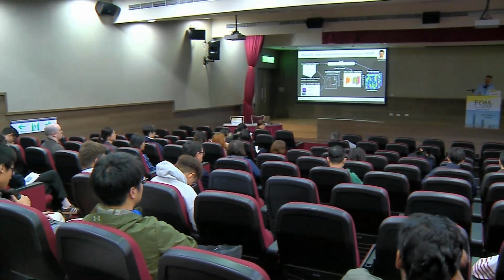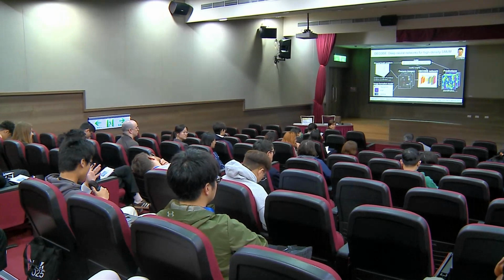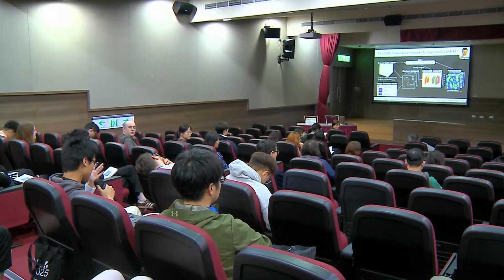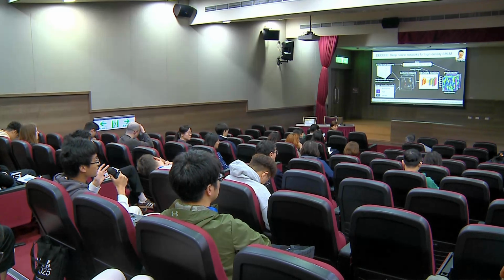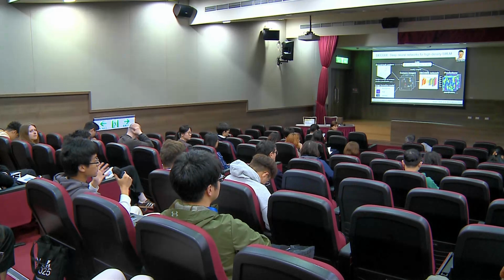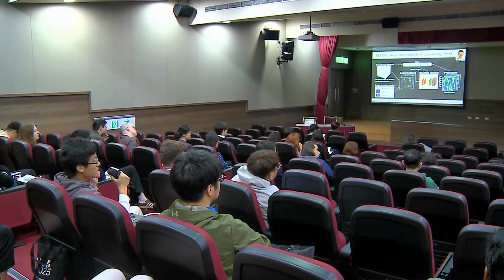My next question: in your presentation you mentioned the SMLM data, and you designed a model and applied the model to output something that looks like a blurred molecular structure. I'm not sure if it is my misunderstanding. You're talking about the local analysis of super resolution?